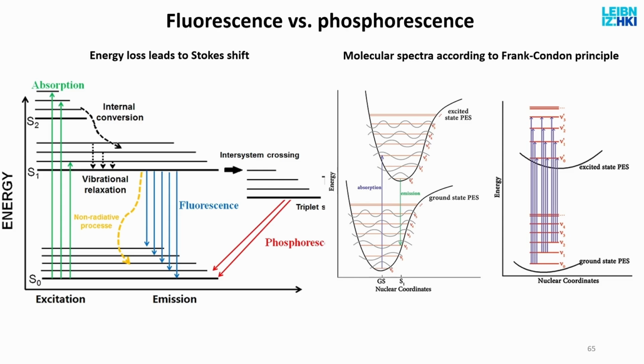So that's very lucky, because this is called the Stokes shift. This is very lucky because if the two wavelengths were the same, with the microscope they would get mixed, and I would not be able to separate illumination from excitation, from emission. And we talk about this later. But they are different. If you have a complex molecule, then of course these energy levels are much more detailed, but the principle is the same.